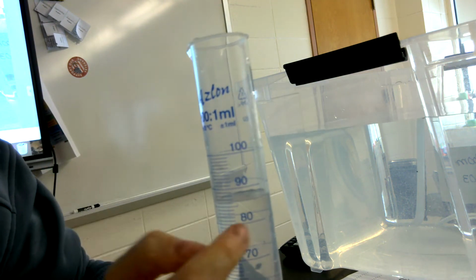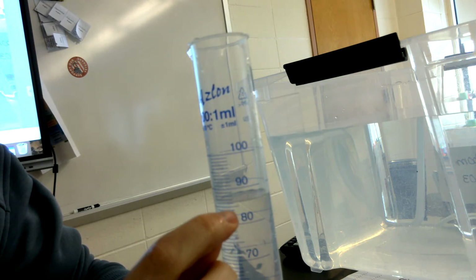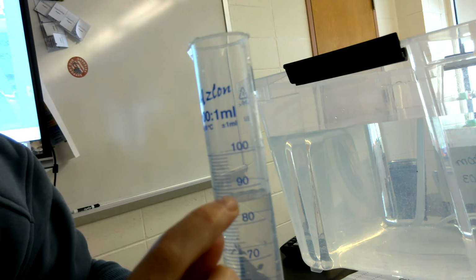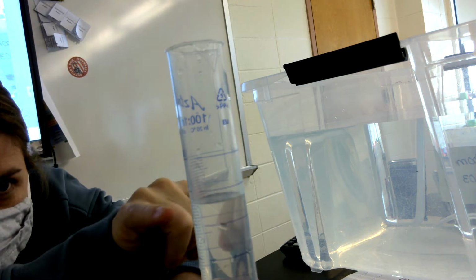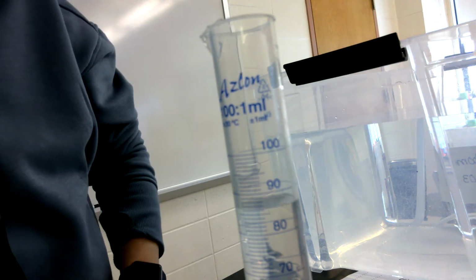So what you have to do is you see this big one line is 80, and then each of these lines go up by 1 on this graduated cylinder. It does change depending on the graduated cylinder you look at. So each of these goes up by 1, and what you have to do is you have to go down to eye level with the graduated cylinder to read it. So when it is eye level, you look at the meniscus, which is the bottom of that semicircle. Okay, so you look at the bottom of that line that is formed by the water, and we have 86 milliliters, okay? So liquid volume is measured in milliliters.